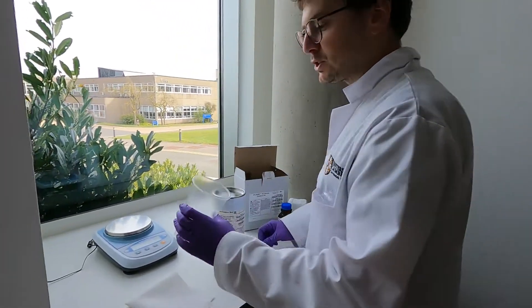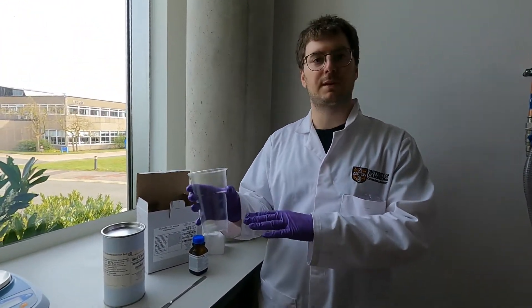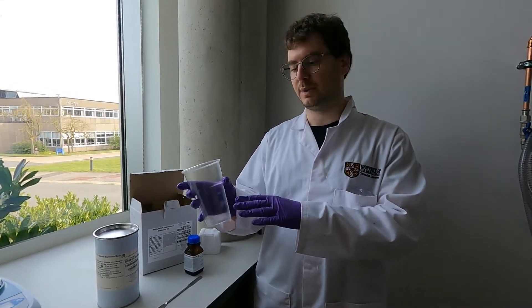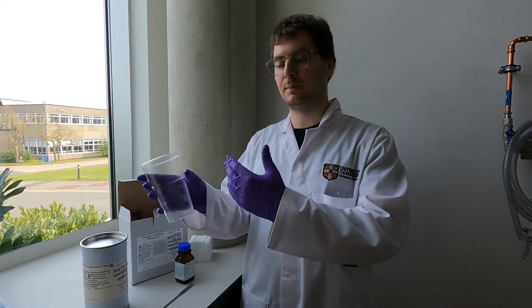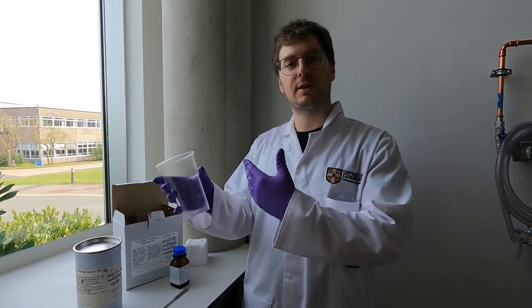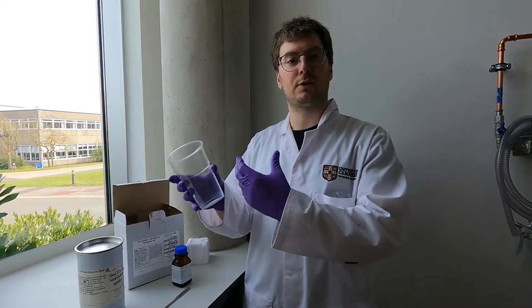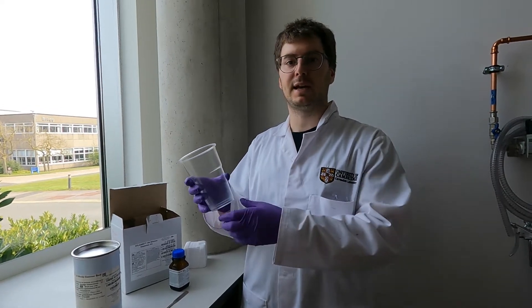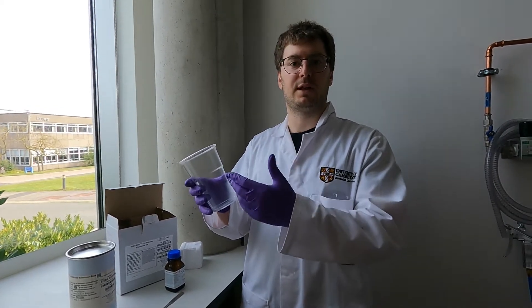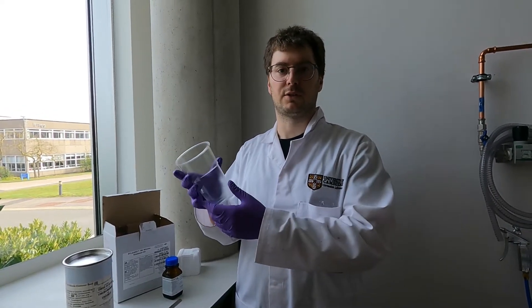I'm going to prepare a cup — you want to be using a relatively big cup. In this case I'm going to mix about 45 grams of PDMS in this cup, which is a roughly half-liter cup, so it should comfortably contain the PDMS. The reason I'm picking a much bigger cup than I need is that once we mix it, we're going to get a lot of bubbles and we'll have to go through a degassing step, which will expand the volume by a very large amount. From my experience, this cup is sufficient for roughly 50 grams of mixture.